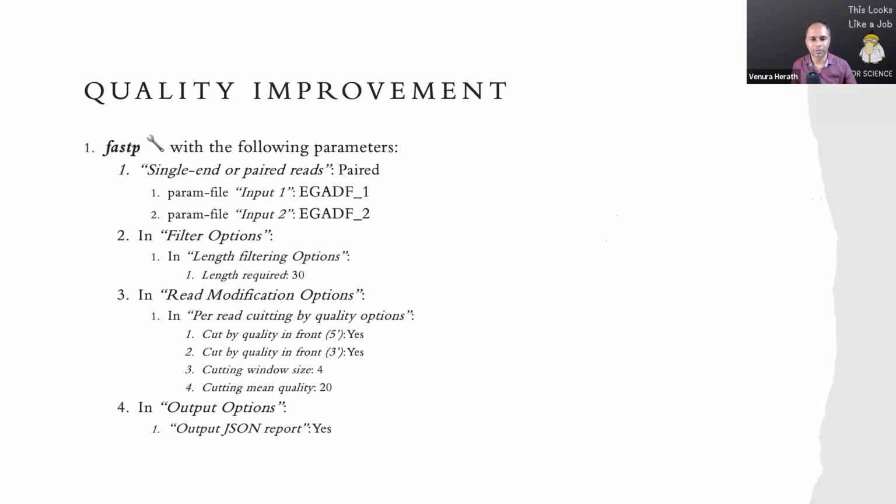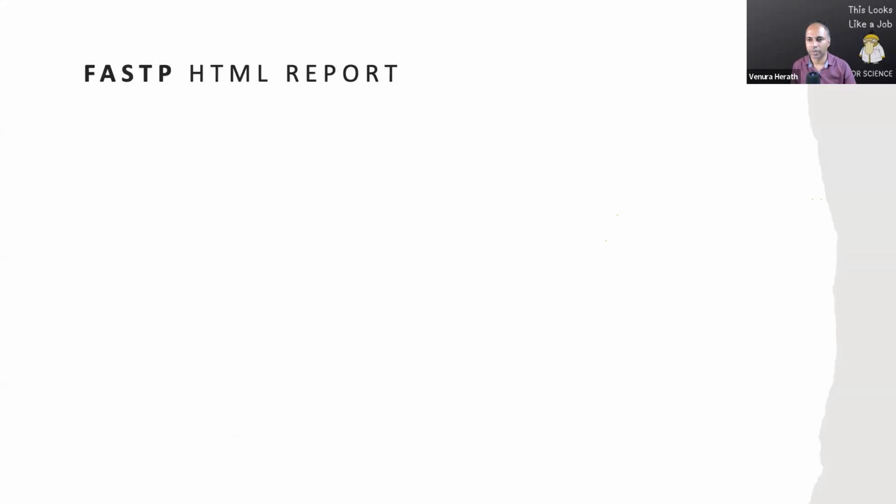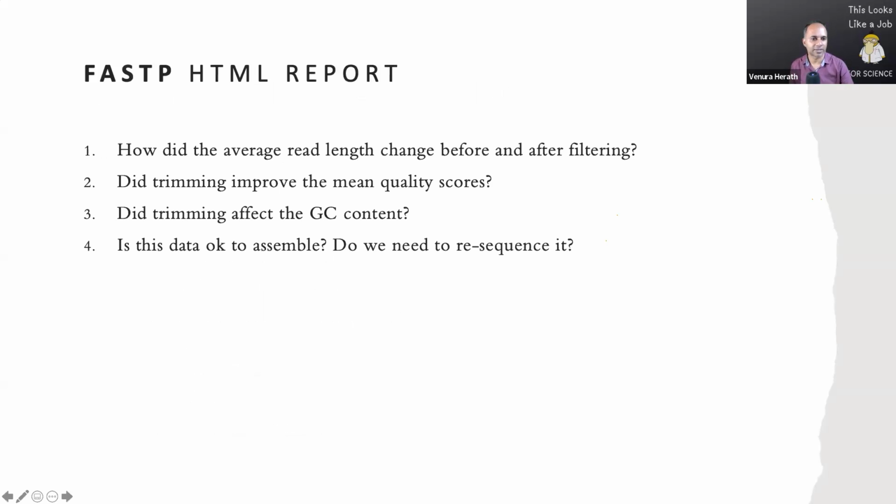Okay, so I'm going to close the quiz. Let me end the poll and go back. Okay. So moving forward, we now have the fastp HTML report. I'm pretty sure you guys noticed that before filtering, the read length was between 190 base pairs and 221. After filtering, it went from 190 to 189, and the other end to 219.